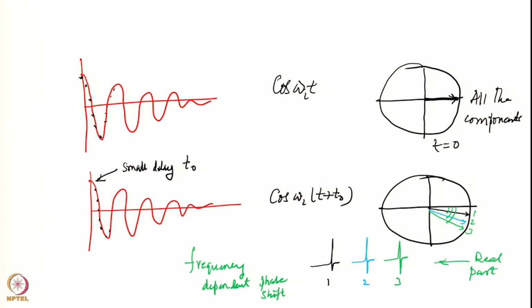So in order to correct for this, here as well as in the previous case, the strategy is to mix the real and the imaginary components.